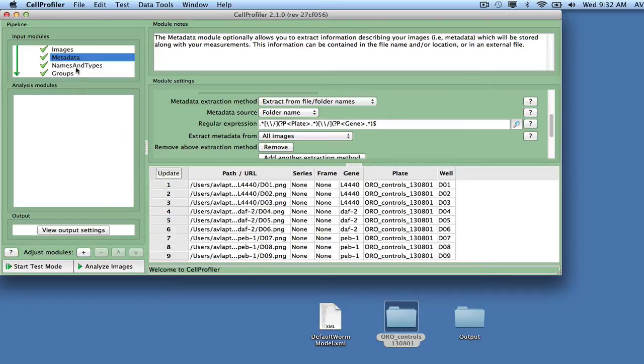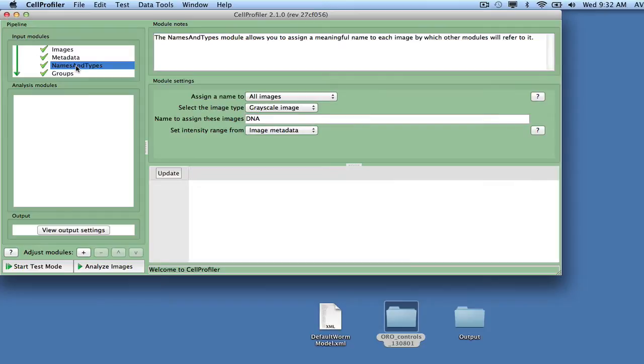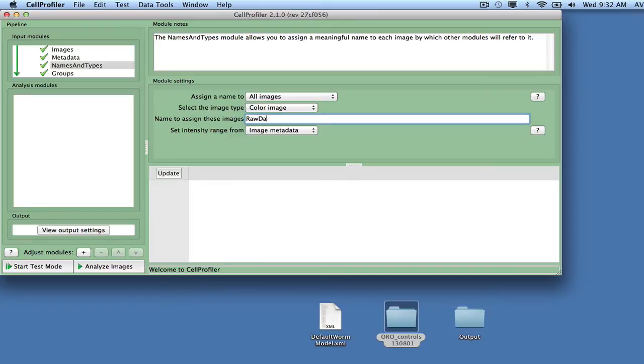Next, select the input module names and types. Set the input image type to color image, and assign the images the name RawData.